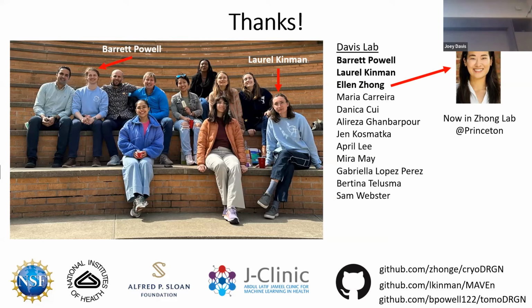So we're still seeing the energy wells and not the maxima. So I think where this could be useful is if you can see within a data set substrates and products, then maybe you can use that as endpoints for MD, and then let the MD try to get you across plausible transition states. But they're lowly populated, we're just not going to see them.